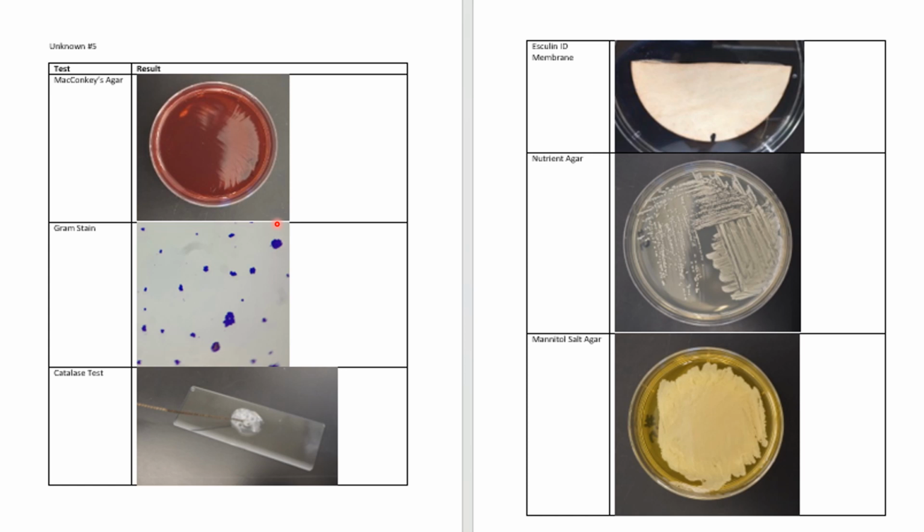Since this is all done virtually, you don't do anything practical for this. The work has already been done for you, but here's the way you want to look at it. It is as though if we were in a live lab, I would just hand you a tube, and on that tube would be a tryptic broth, just like you're familiar with from your lab kit, and it would be cloudy to let you know there's an organism in there, and on the tube I would have written number 5.